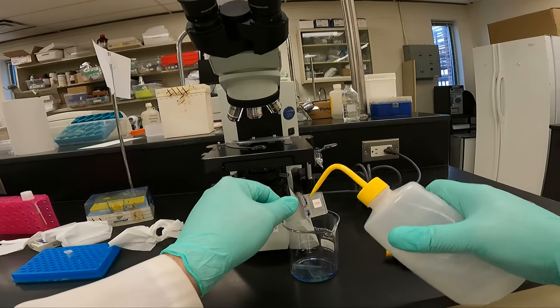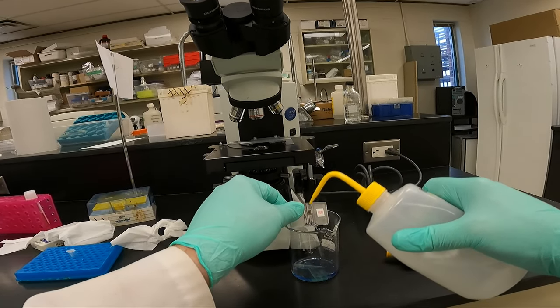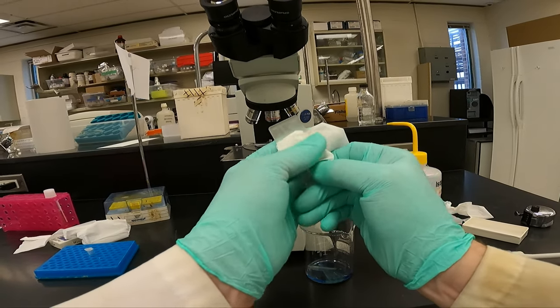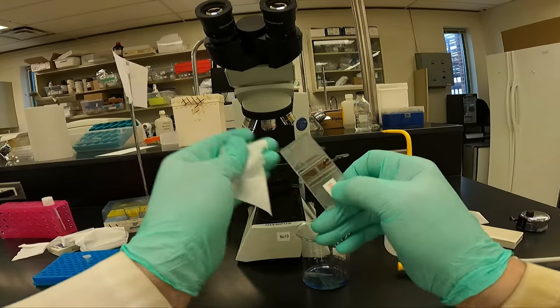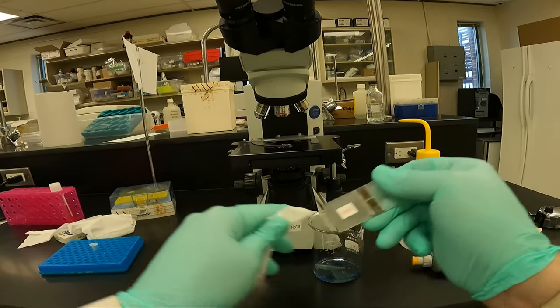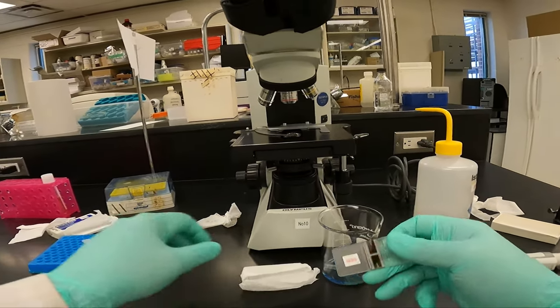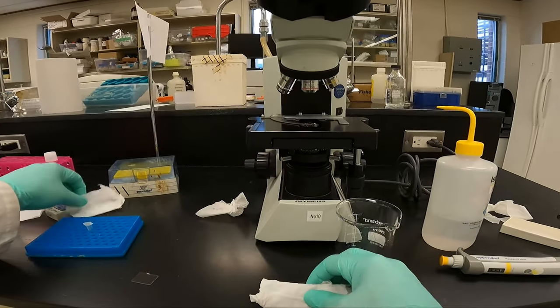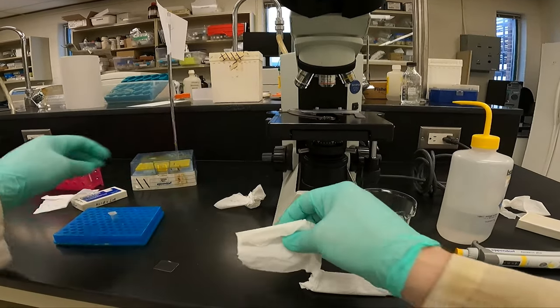Do the same thing with the hemocytometer. Spray it down with some isopropanol, and give it a wipe with the Kim wipe. I wrap this in a Kim wipe just to make sure it doesn't get scratched. And I'll do the same thing with the cover slip.